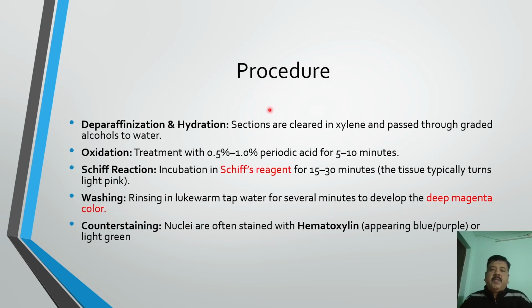So what is the procedure? Paraffin blocks will be there, stored in the archives of the histopathology section from suspected cases. First, deparaffinization and hydration. The sections are cleared in xylene and passed through graded alcohols to water.